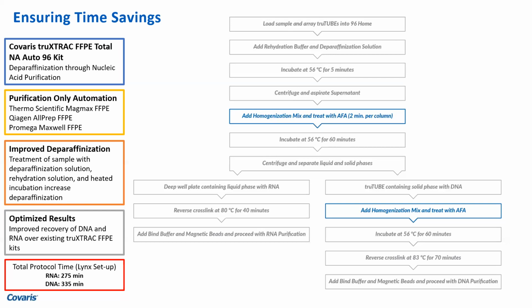And then we again provide some cross-linking buffer where you will now see a pellet in the tube and a supernatant. So this pellet is the place where all your DNA is. And supernatant is where your RNA is. It's easy to separate a pellet from a supernatant, right?